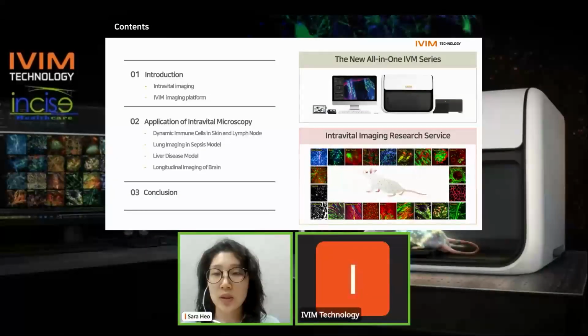So this is how today's webinar will follow. I will go over intravital microscopy and the imaging platform of IVM Technology first. Then I will provide applications of intravital microscopy. Today, I will show you images of immune cells, the lung, brain, and liver, which were obtained using intravital microscopy. And then end with the conclusion.